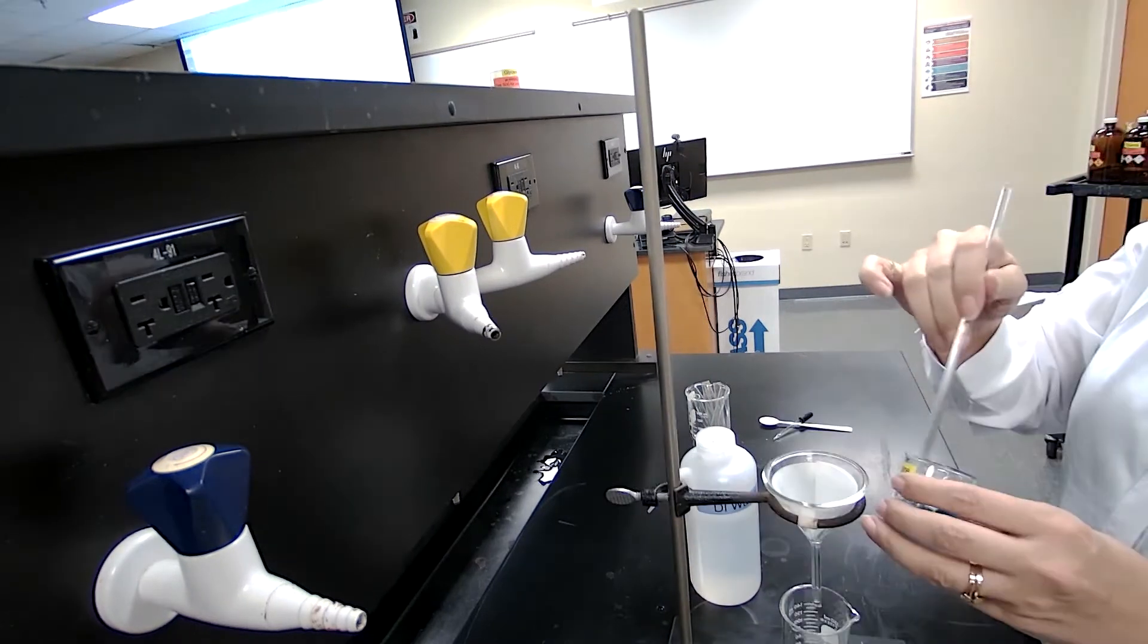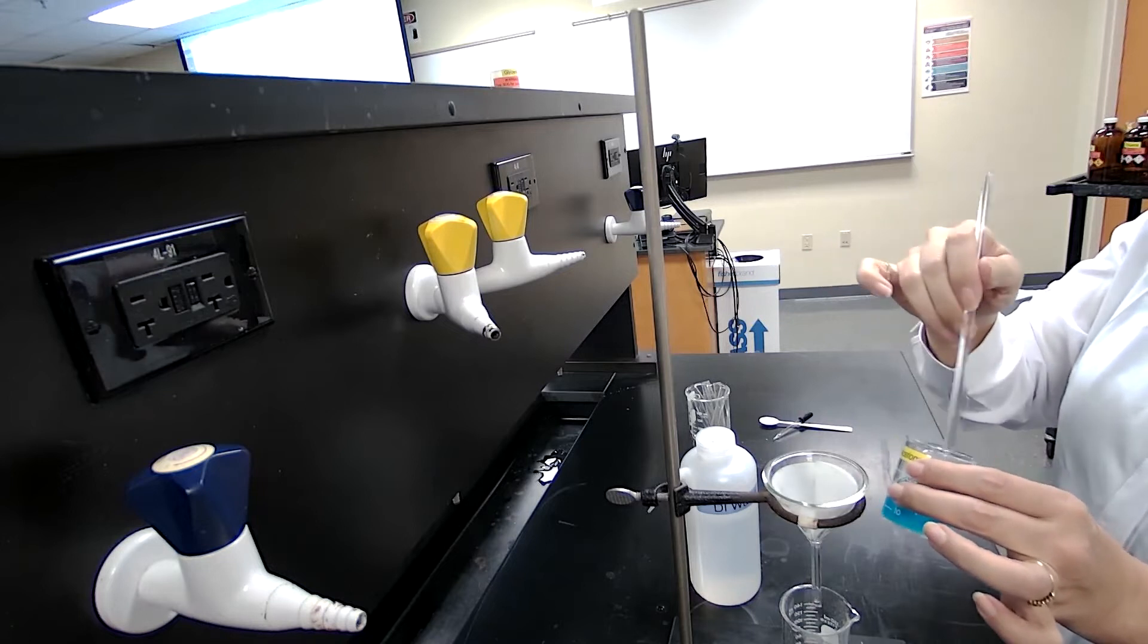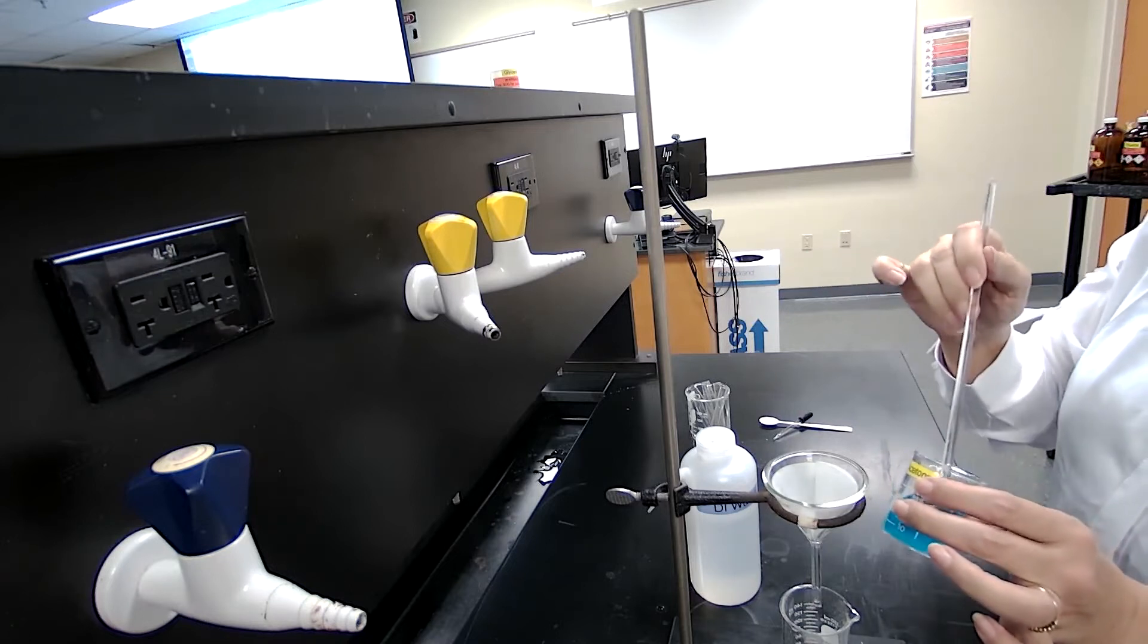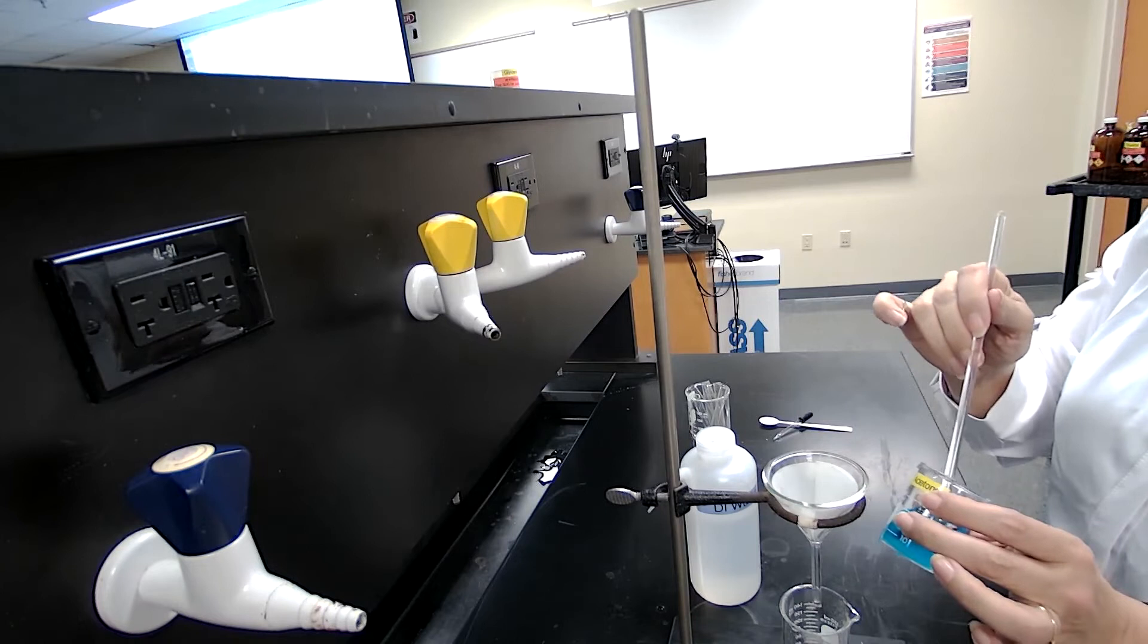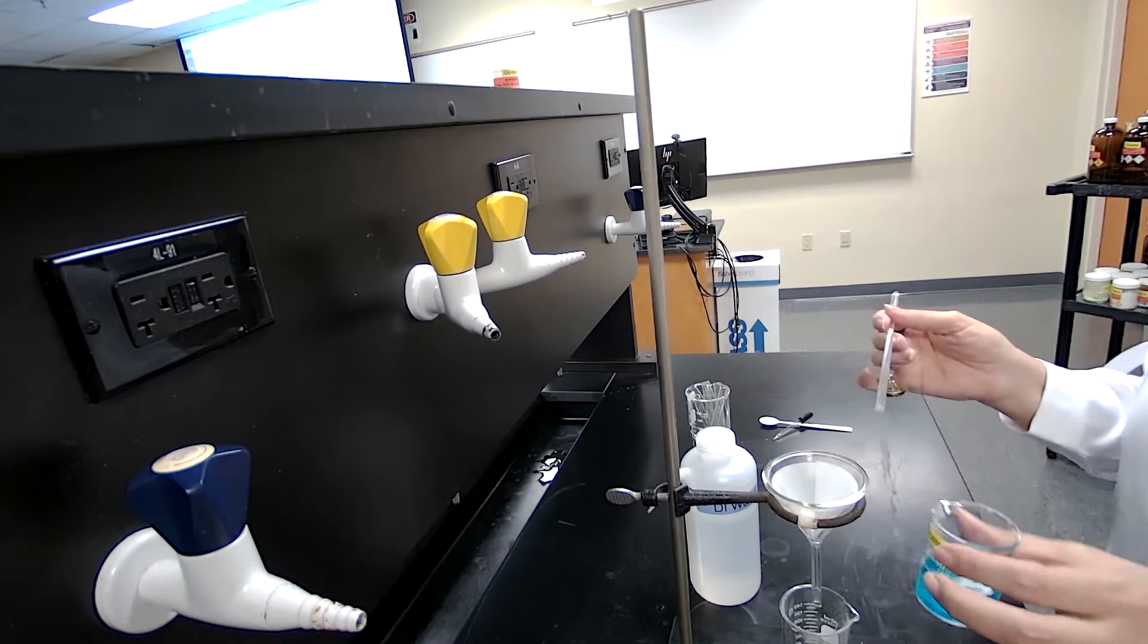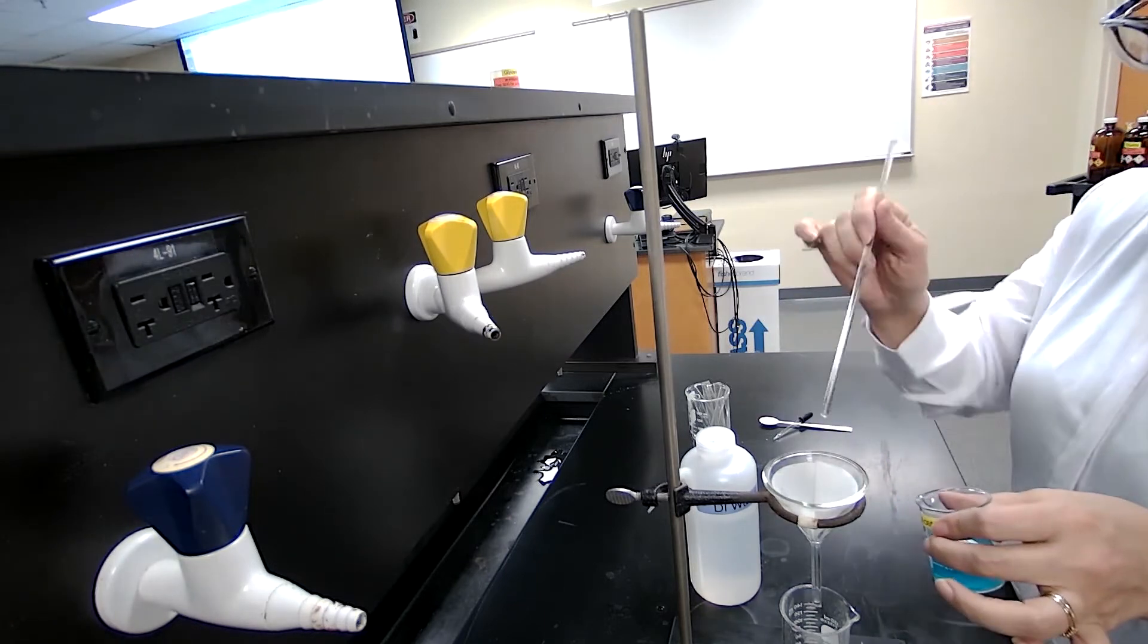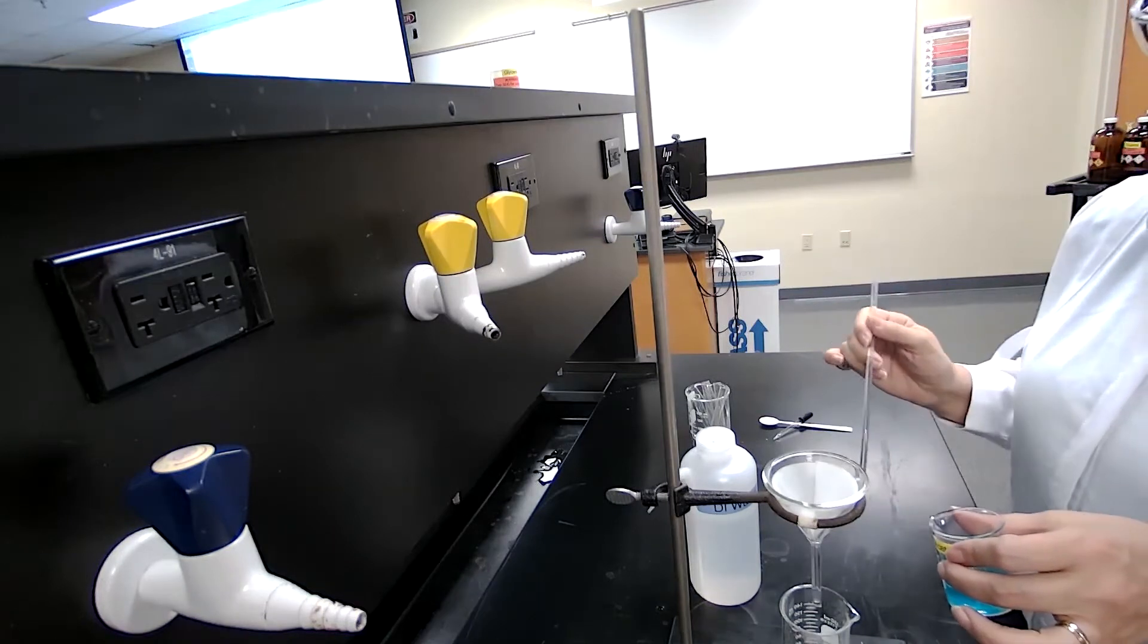Gravity filtration is different from decanting. Decanting is another technique which we will talk about in different experiments. But here we are doing filtration. We want to separate the solid from the liquid. We want the solid to stay on the filter paper and the liquid to pass through the filter paper.